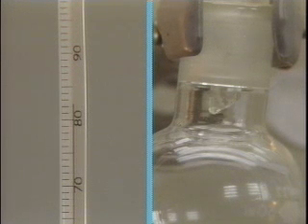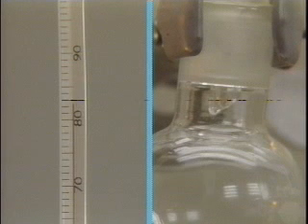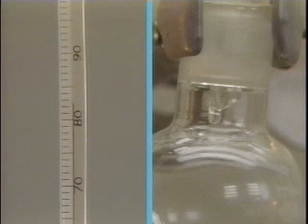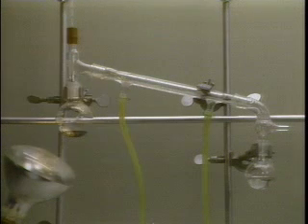The highest temperature reached while this distillate is being collected is recorded as the top of the boiling point range of the distillate. If the first few drops of distillate come over at a much lower temperature than the major portion of the distillate, it is advisable to collect these drops in a separate container. At any time during the distillation, the process may be stopped by either turning off or removing the heat source.